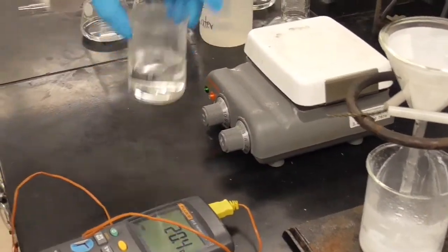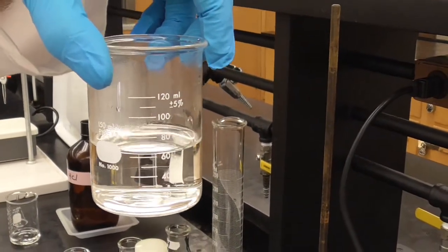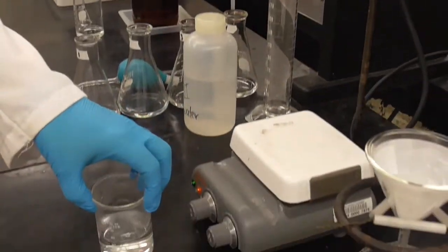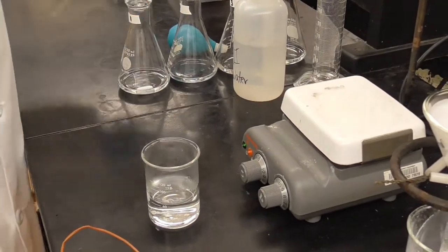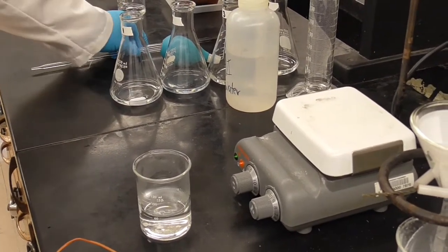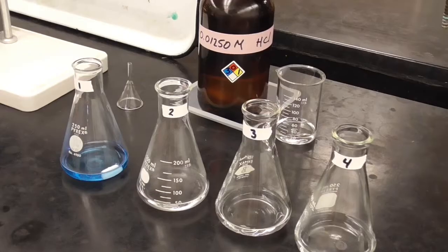And so this is our solution. We've got 60 milliliters of the hot solution at the temperature we recorded. And we've got to let it cool before we can do the pipette, because the pipette is not accurate at a high temperature. It's only accurate at 20 degrees. So we've got to let it cool down. So we'll join you back when it gets cool.